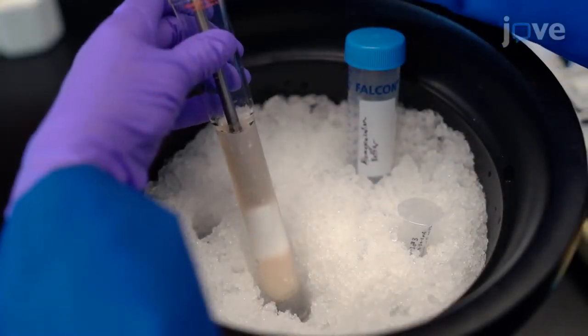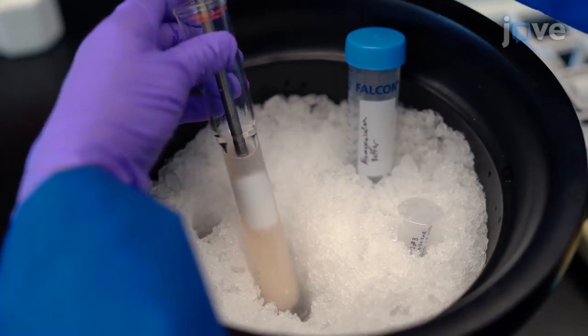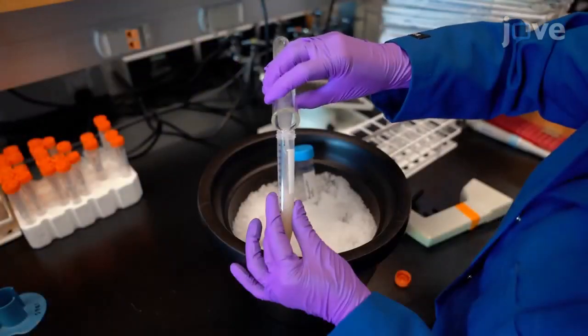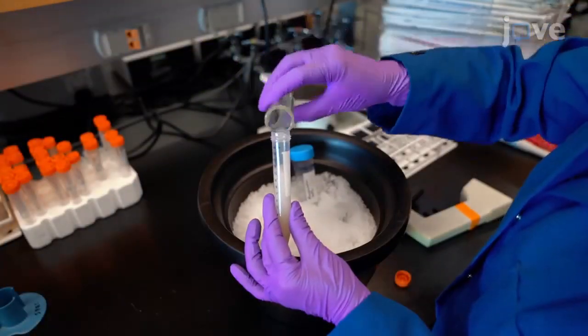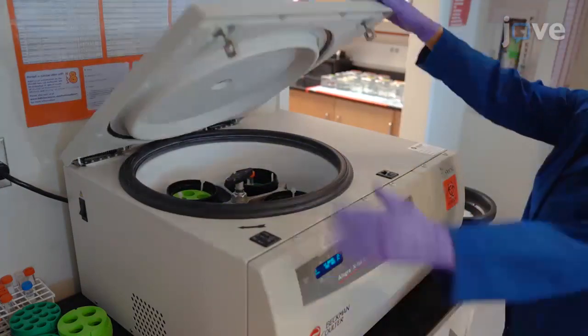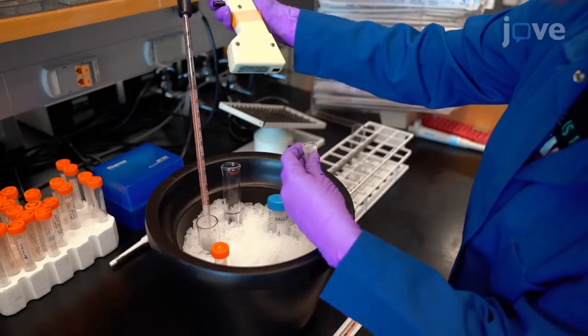After dissecting out the brain, homogenize it immediately in 10 milliliters of homogenization buffer in a glass homogenizer on ice, using approximately 12 strokes. Centrifuge the lysates for 15 minutes at 1400 times G and 4 degrees Celsius. Transfer the supernatant to a new tube on ice.